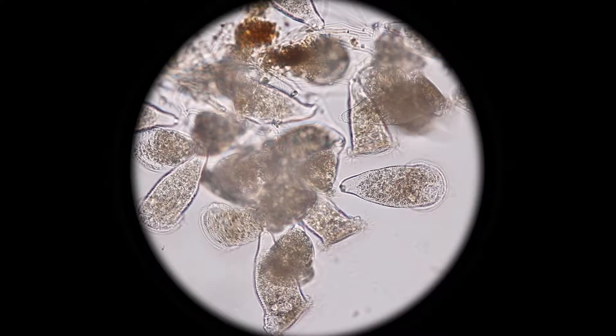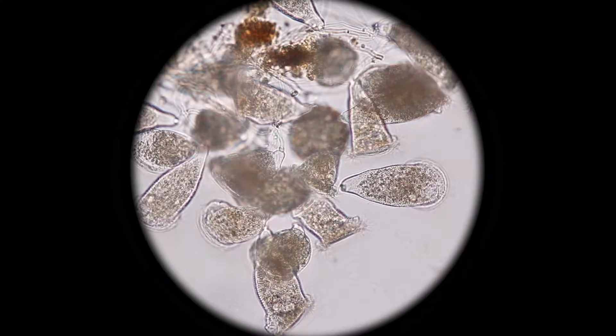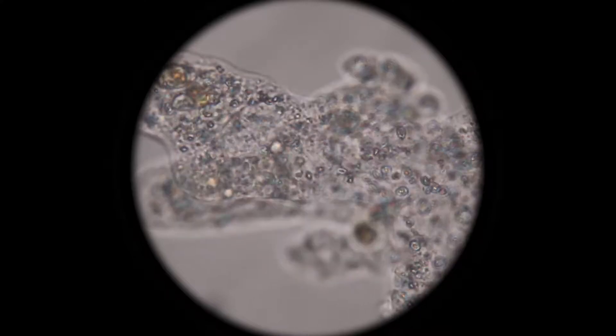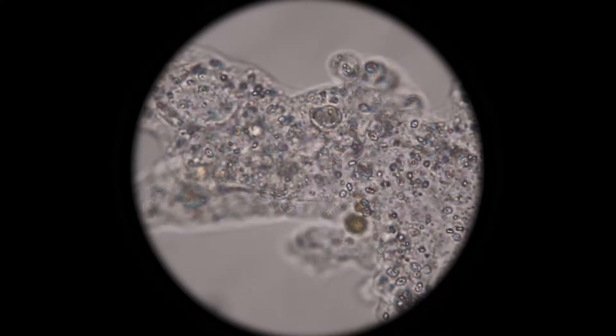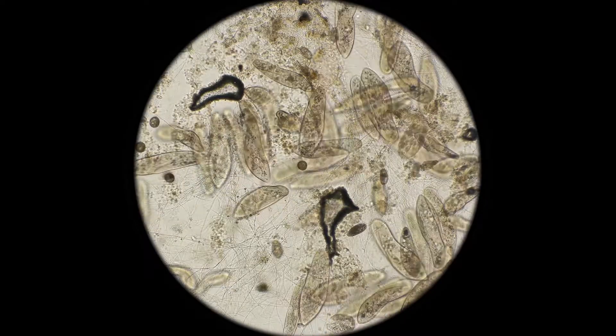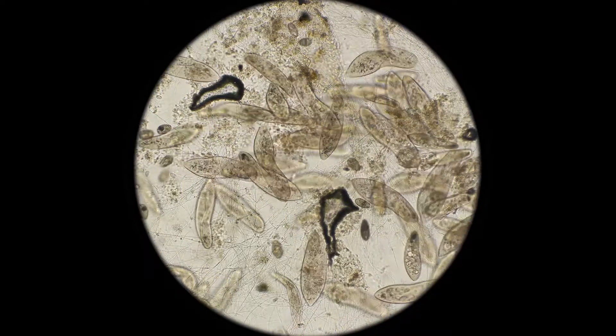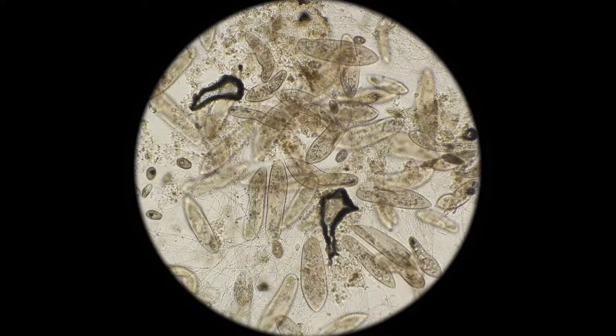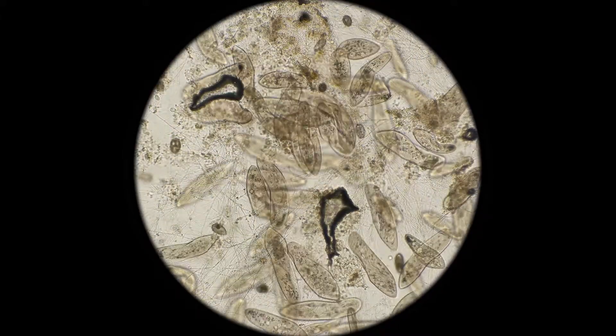To see the details of a specimen when viewing it with a compound microscope, the specimen must be extremely thin so that light can shine through it. Because tiny microorganisms, such as protozoans, are usually quite thin, their external and internal structures can be seen with a compound microscope.